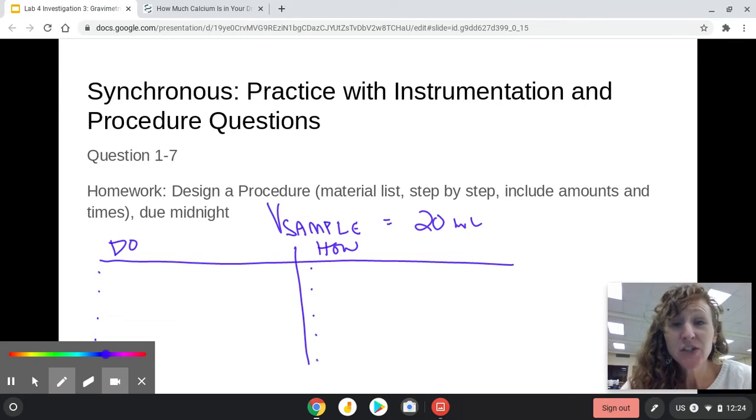Okay, welcome back. So one of the important questions you should have thought about is how much sodium carbonate you are going to add to your water in order to get all of this calcium to precipitate out. So there's a couple different ways you can approach this. First of all, you could try a visual approach where you pour the two solutions together and see if much more precipitate forms. Now, that is a tricky way to do it because you're relying on your visual ability and you're forming a cloud at the same time. So it's probably not the most reliable approach.